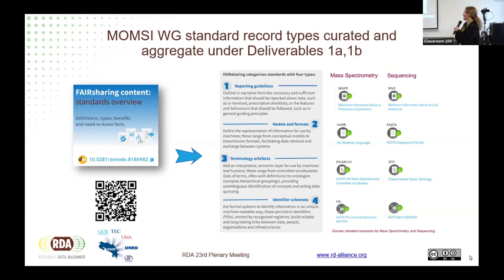Yeah, I mean, most of the standards that we're aggregating and curating are specific to metadata. Metadata is really the high currency in interpretation. I will actually say that there are quite a couple of group outputs that we have in our universal tab. Like we have the PIDs for instruments, that is huge. Instrumentation and metadata around what instrument is selected allows you to compare apples to apples, not apples to oranges. So that's not something that's very obvious at the surface. And I think that we're also coordinating with your working group to make sure we capture whatever developments your group is doing as well.